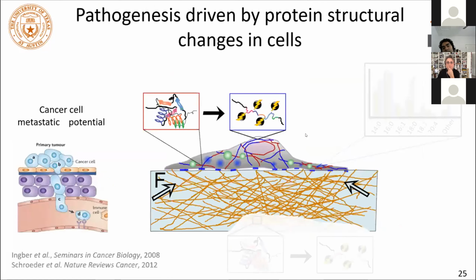Okay, so that's imaging protein structure outside of cells, right? That's pretty easy because now we have only one protein there. So we know the protein is fibrin. There's nothing else there. So everything we know that we're looking at, we know is fibrin. That gives us a signal. That's cool. So what about imaging protein structure in cells?